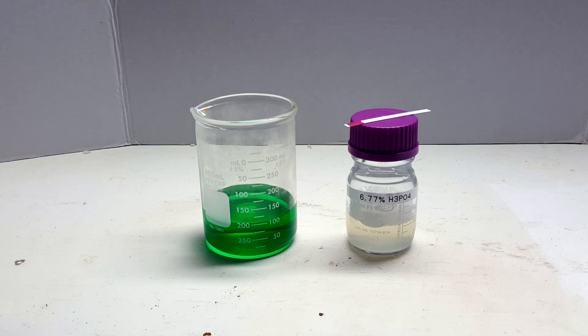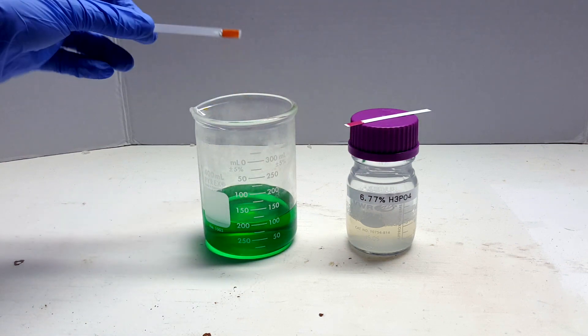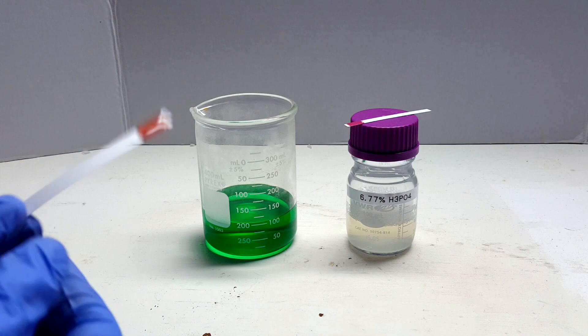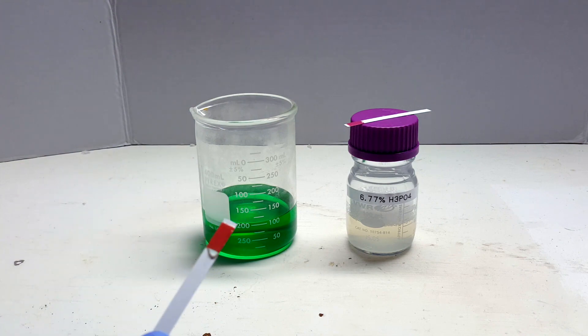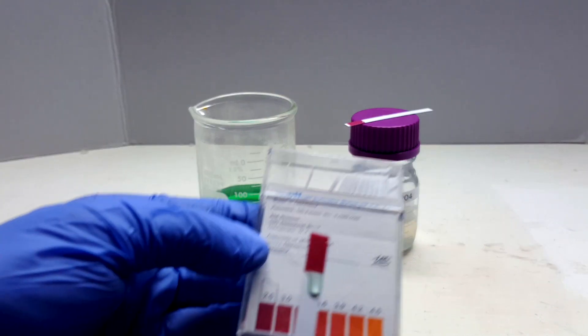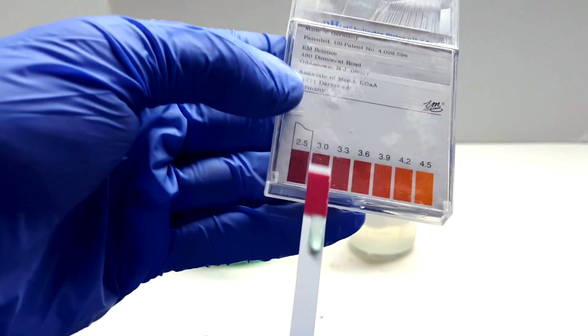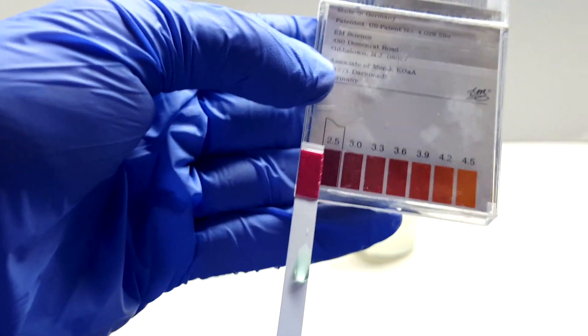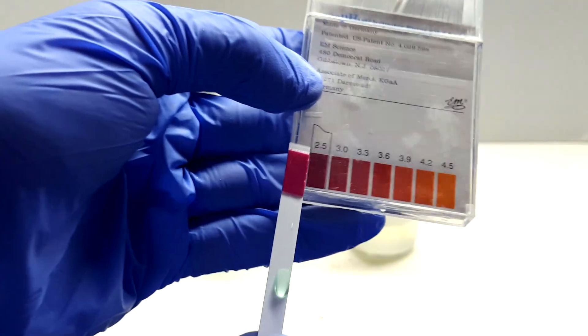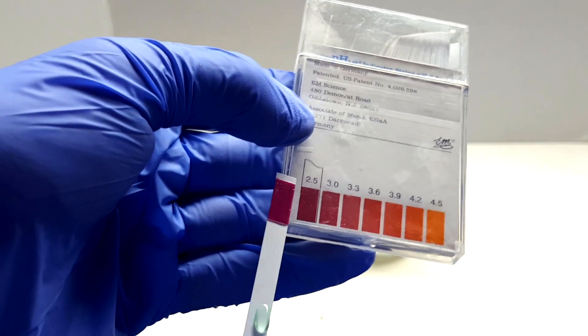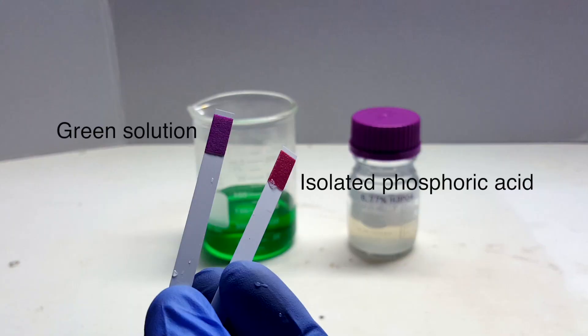I saved the green solution left in the distilling flask from the last run and let it evaporate down some. Testing with acid-specific pH paper, the green solution is actually more acidic than the paper can measure. This means there's still plenty of phosphoric acid left to be extracted. In fact, the acid actually isolated was less acidic, judging by the color of the paper, than the remaining green solution.